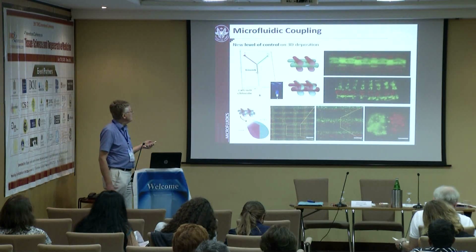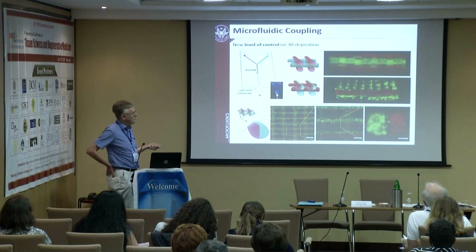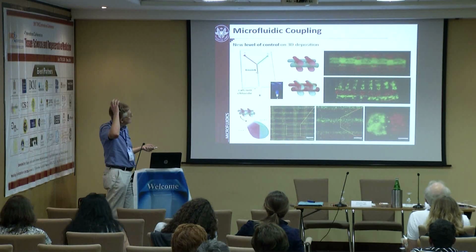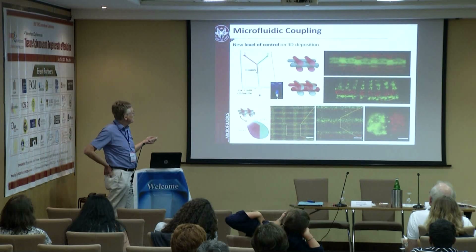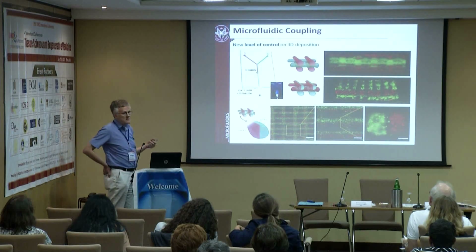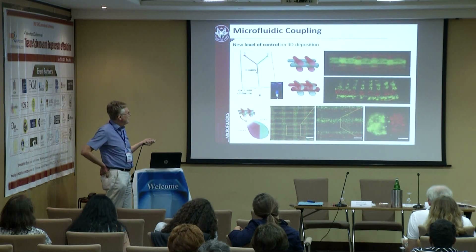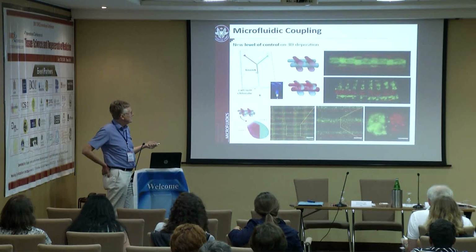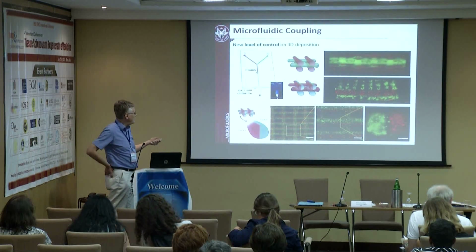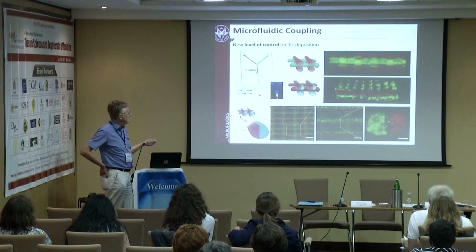So finally, to illustrate the possibility of creating a multi-component and multicellular tissue construct, we integrated our dispensing system with a microfluidic chip. So the aim is to print a scaffold formed by different materials arranged in an organized way, to replicate to some extent the heterogeneity of native tissue.